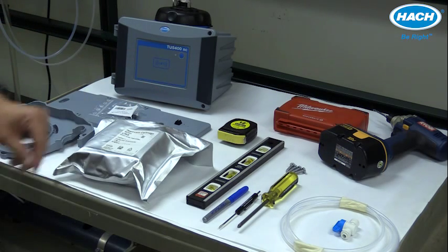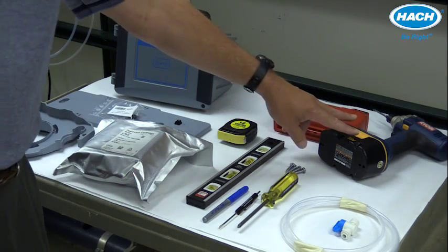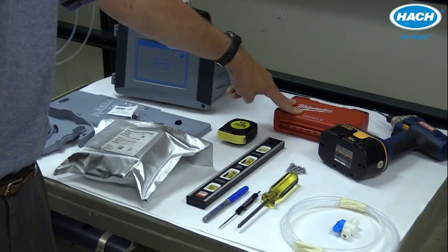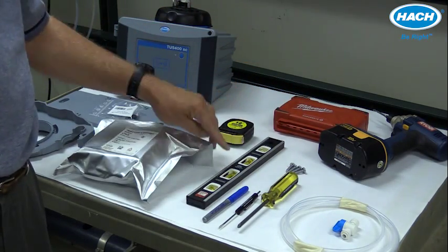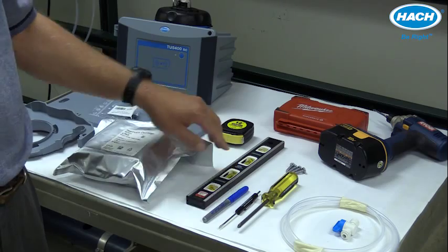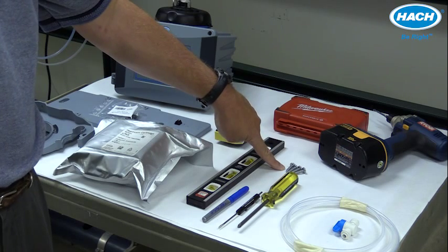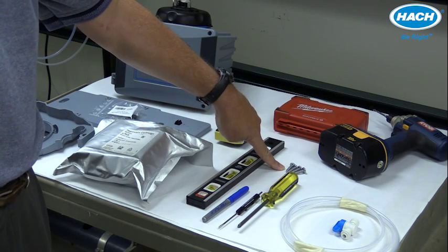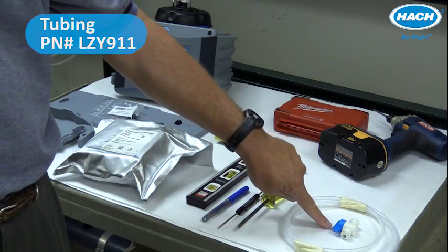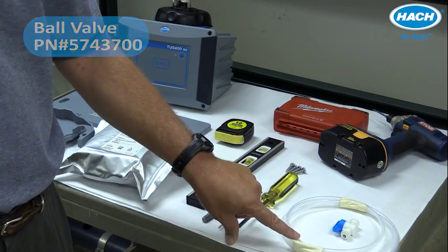In addition, a variety of necessary tools and apparatus will also be needed. This includes a drill, depending upon how the instrument is to be mounted, bits for the drill, a tape measure, a level to make sure the instrument is mounted plumb and level on the vertical surface, a marking pin, a variety of Phillips screwdrivers, and screws depending upon the material you're mounting the instrument on. Additionally, quarter inch tubing and a ball valve to allow stoppage of flow is needed but not included with the instrument.